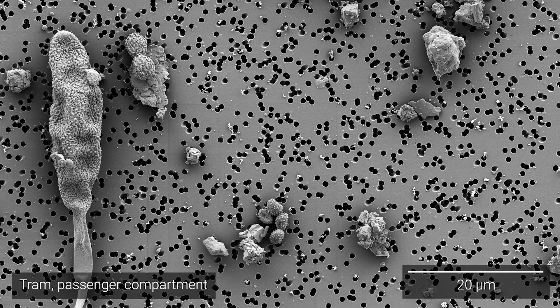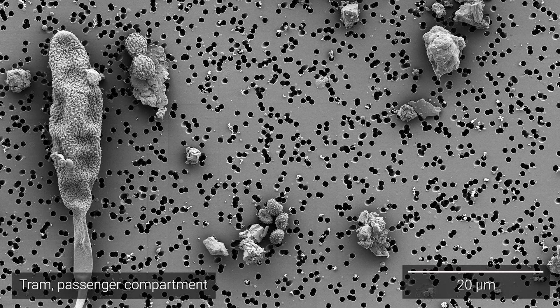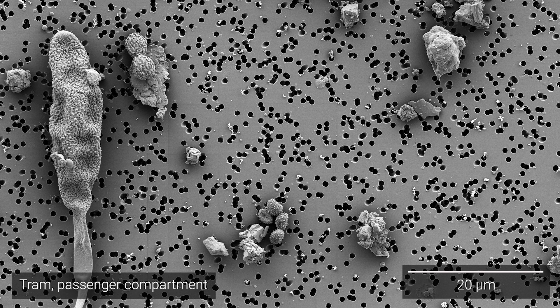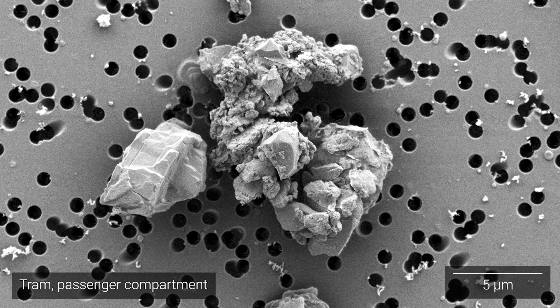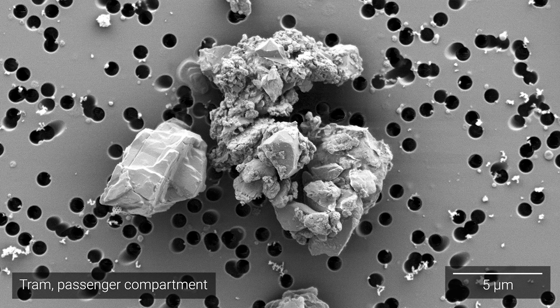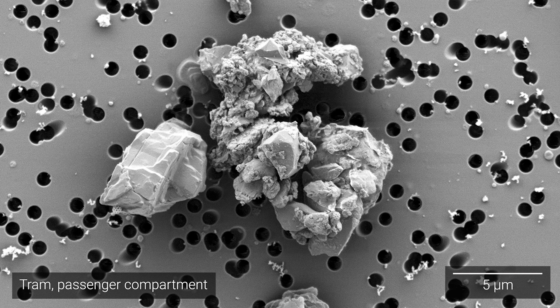This is why it's important to identify the sources and eliminate these particles from the air.